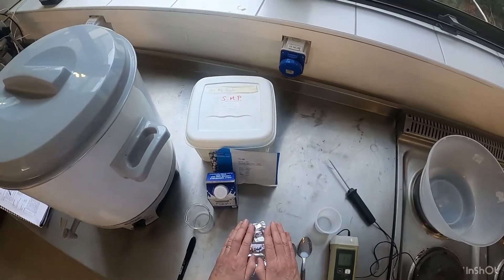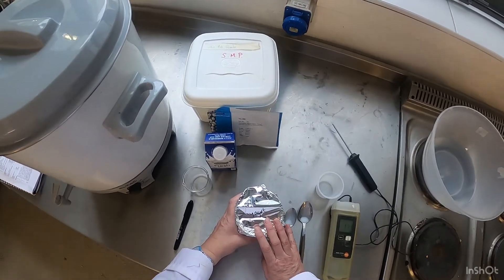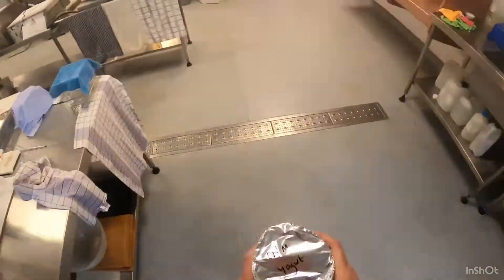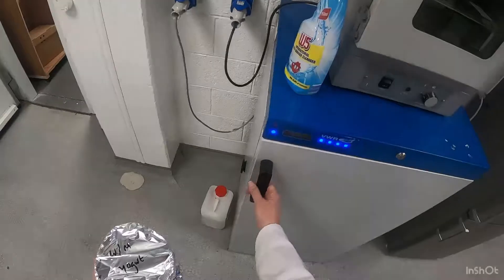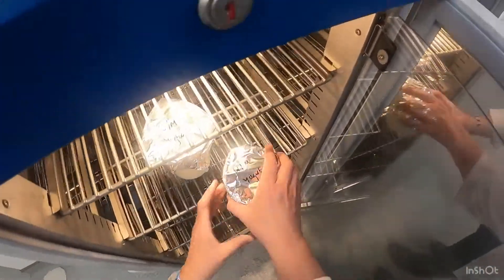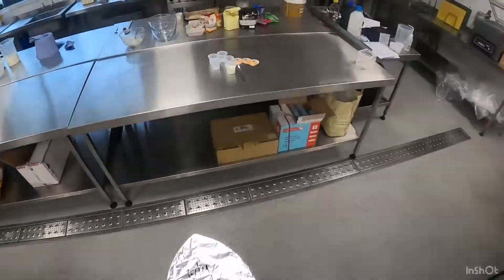Like every bacteria, it needs time to grow, so we're going to put the whole milk sample with the starter culture into the incubator at 37 degrees overnight. This is our incubator, and I have one already that I put in yesterday that I'm going to take out now.